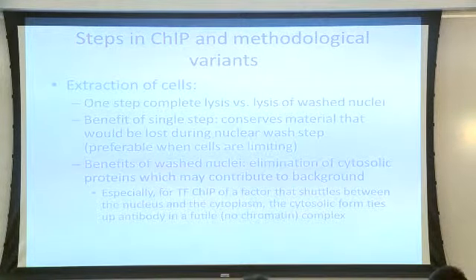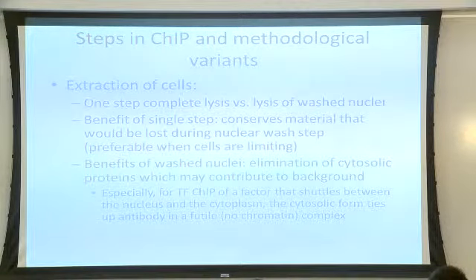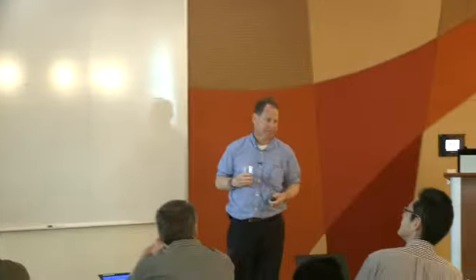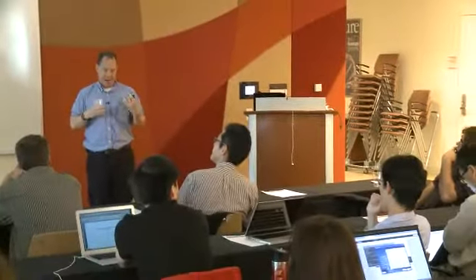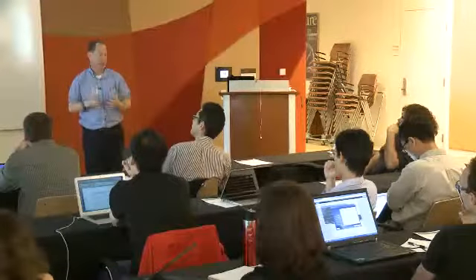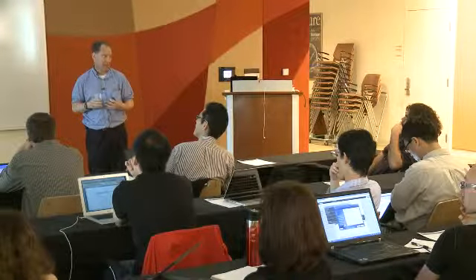This precedes cross-linking, or? No, the cross-linking is done while the cells are still alive, actually. It's the way of killing the cells. But then once you have the cross-linked material, you can extract them initially with a detergent that merely lyses the plasma membrane and sediment out the nuclei, and then change the detergent milieu to lyse the nuclei as well.